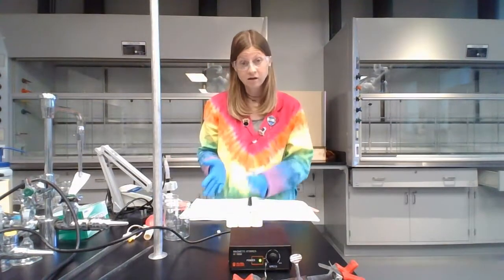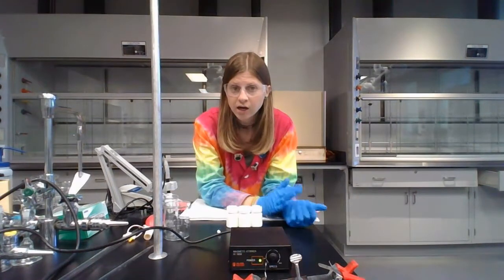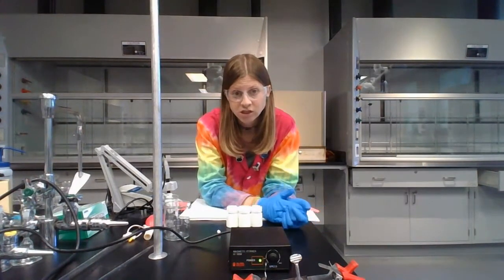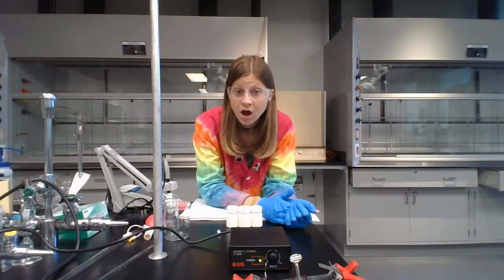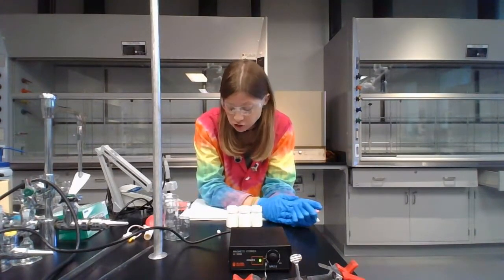So part A of the lab is how to calibrate the pH meter. And again, you're going to be following the instructions from the information that's given to you when you get into lab, as well as this information being covered in the pH meter video on how to handle the pH meter probe and the correct way to deal with the pH meter in general.